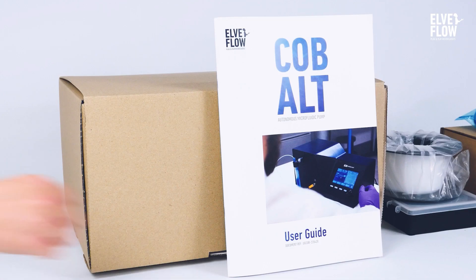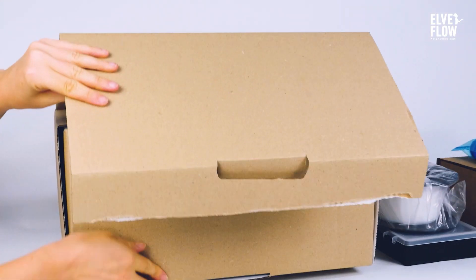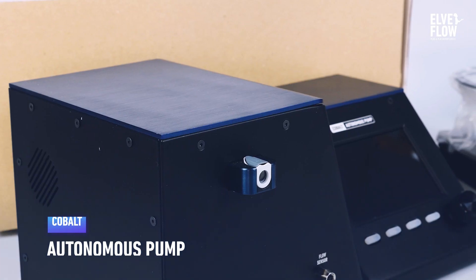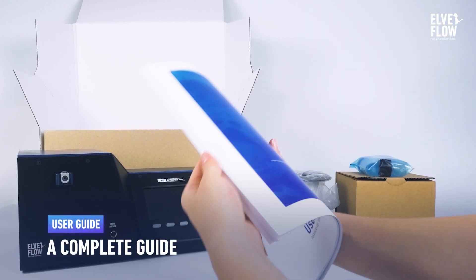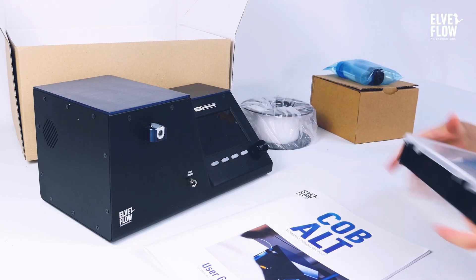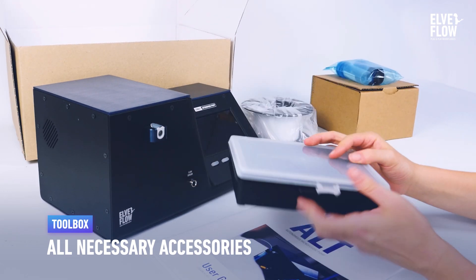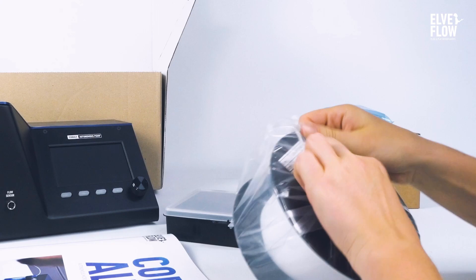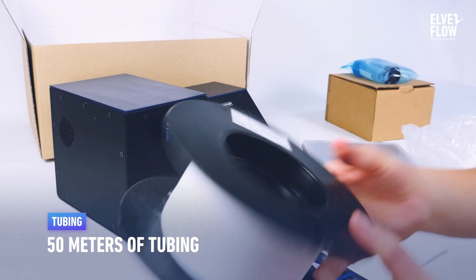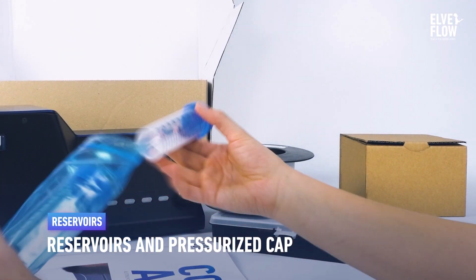Let's see what's in the package. Obviously, the Cobalt Pressure Controller — wow, look at this blue wave. A complete user guide to explain everything you need to know about the instrument. A toolbox kit that contains the fittings to connect the Cobalt to the reservoirs. 50 meters of tubing. A reservoir with a pressurized cap.